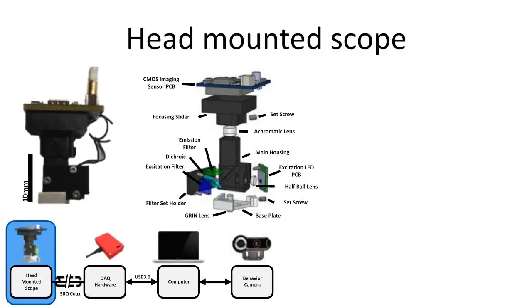And so a little bit more about the microscope. So you can see a layout of the initial microscope that we designed. This is the microscope body that is machined, and the designs are all there on the Miniscope website. This is the GRIN lens that we use, and again, I'll point to things.